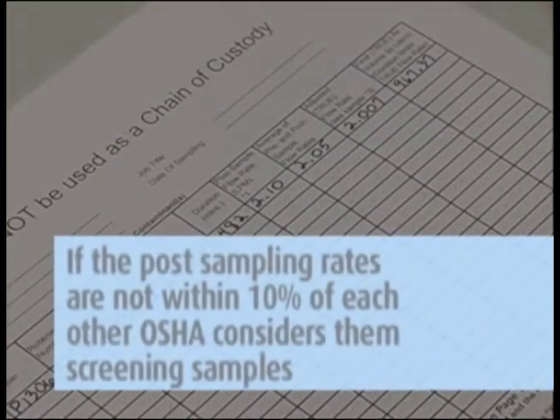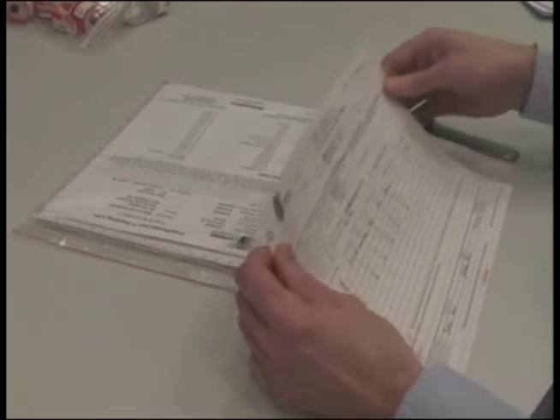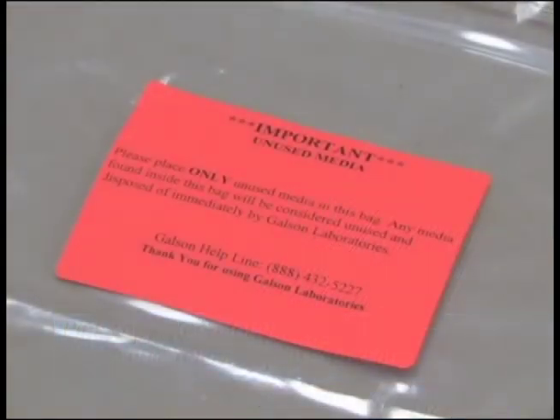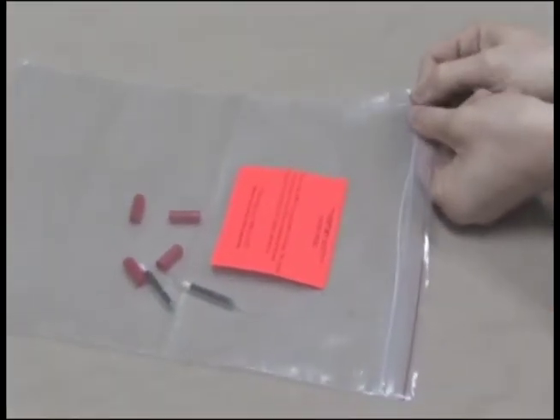If the post sampling rates are not within 10%, OSHA considers the samples screening samples, and if the analytical results show high levels, resampling is recommended. Then complete the chain of custody form. It is important that you include all the information requested in order to ensure the turnaround time of your samples. Remove the pink copy and keep this for your records. Send the white and yellow copies in with the samples to the lab in the large Ziploc bag. Please place any unused media inside the Ziploc bag marked with the orange unused media label — this will indicate that these items should not be analyzed and will be properly disposed of by Galson Laboratories.